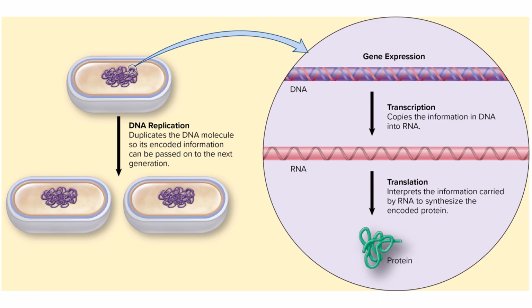So when we think about genetically modifying organisms, we want to go back to the dogma of molecular biology. Because what we're doing ultimately is changing, in this case, the available DNA to be read. And by changing that blueprint, we can produce RNA that then is translated into proteins, and those proteins do stuff. In the case of pGLO, we're going to be producing a protein called green fluorescent protein.